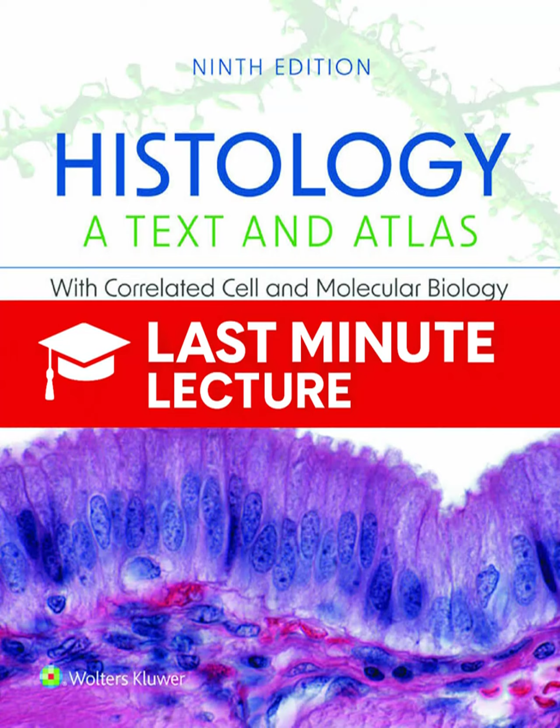Getting clear margins. That's the one. It's life or death information. So how fast is this whole process, from the surgeon handing off the tissue to the pathologist calling back to the OR with a diagnosis? It has to be extremely fast. We're talking as little as 10 minutes.